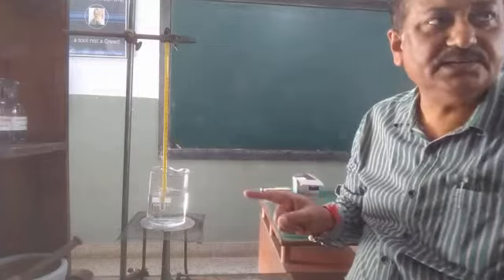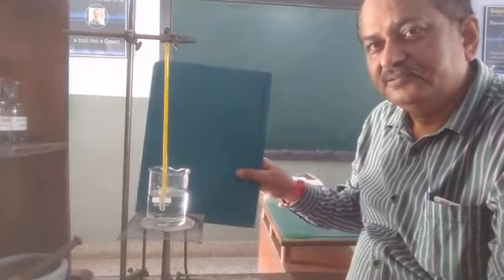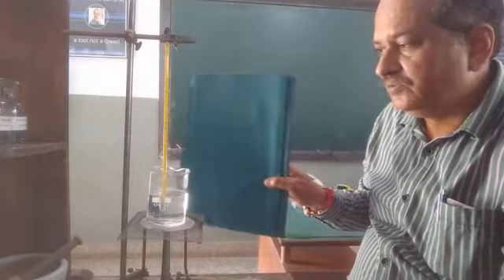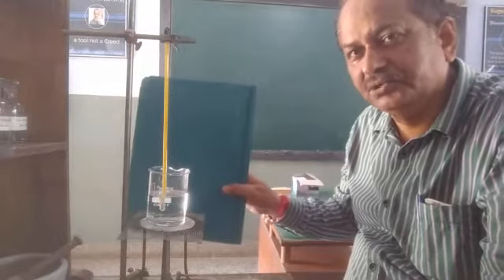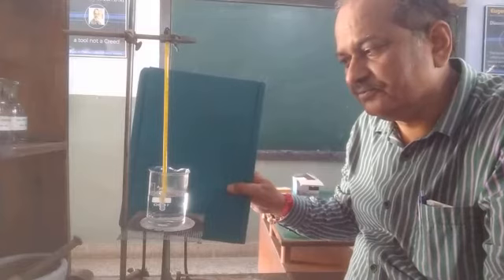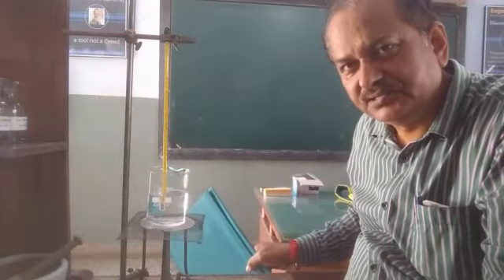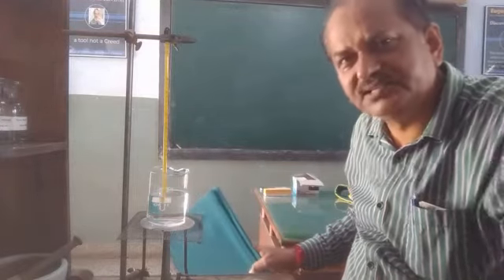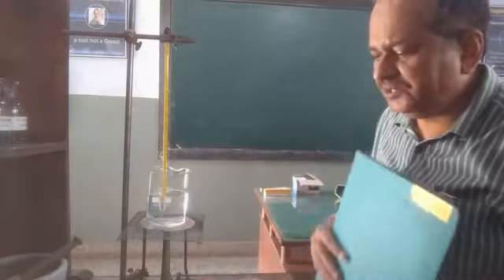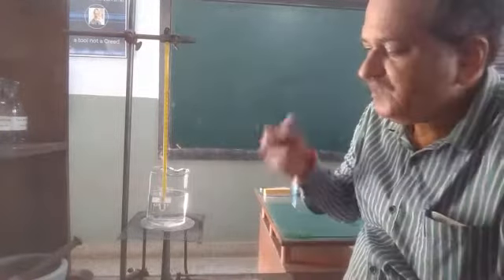You can see the bubbles have collected in between. Here I am trying to show you the vapors of the water. You can see water vapors are coming, but in less amount. But as the temperature has increased to 80, slowly and slowly more are coming.